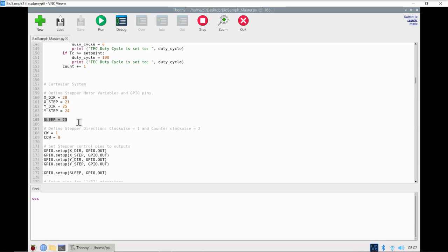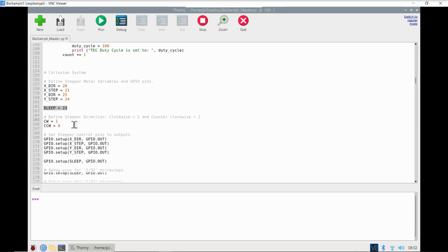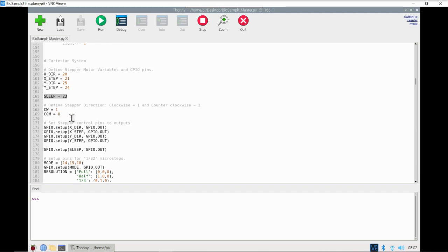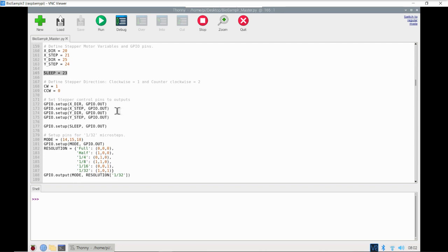We will turn off the motors when they're not in use. Next we define those directions of the stepper motors — clockwise and counterclockwise — and we set our five GPIO pins as outputs.